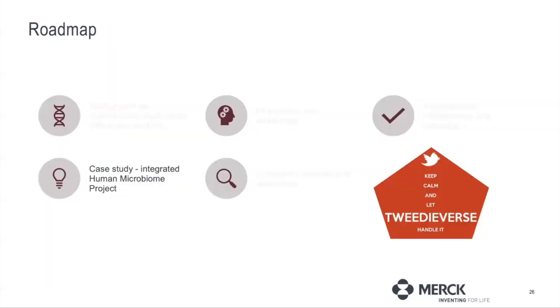So with that, I am going towards the case study using the integrated human microbiome project, which is part 4 of my presentation.